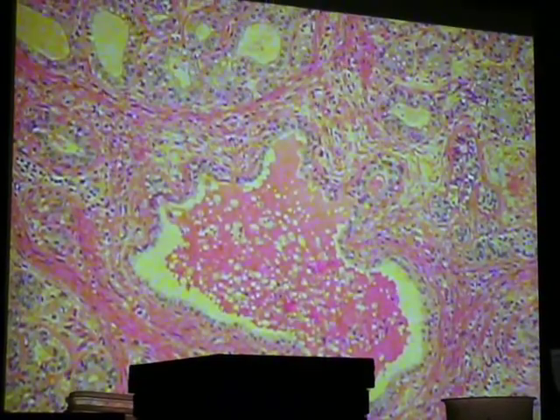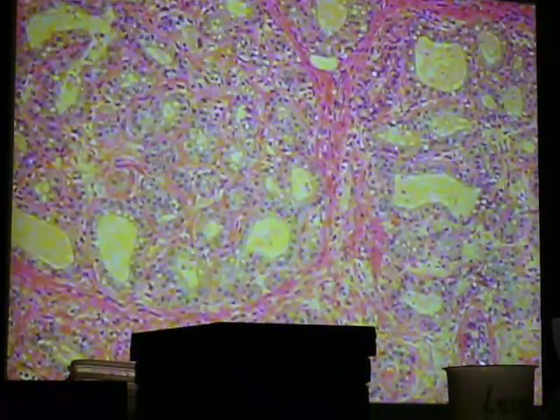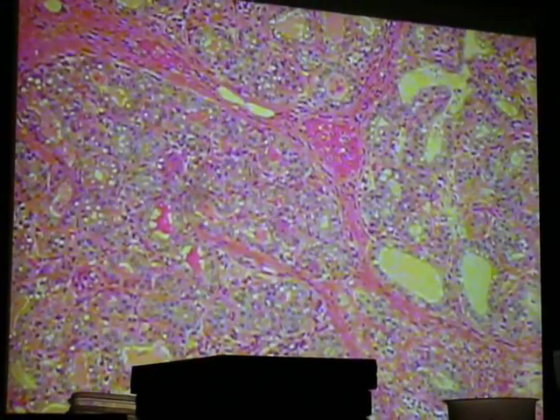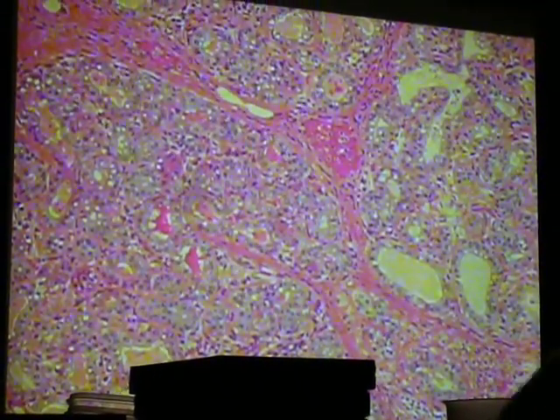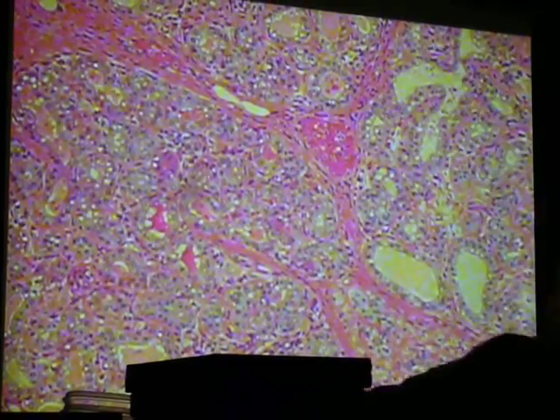That'd be a lot different stuff in the middle with milk secretion in there. But there's just no empty, smooth areas with just connective tissue like we're going to see in the non-active. So let's compare those.